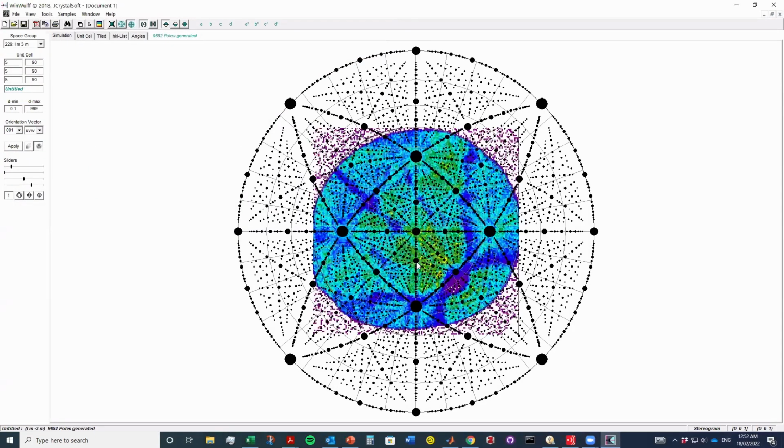Increase the spot size there. You often get this weird shape, it looks like a lolly wrapper or a bow tie, for 011. So for steels, I often use that as a quick way to know straight away, okay, that's 011, right? And then I go from there. So you can use those little hacks and tricks. So where's our 011? Yeah, that's an 011, but I'm going to use this one.